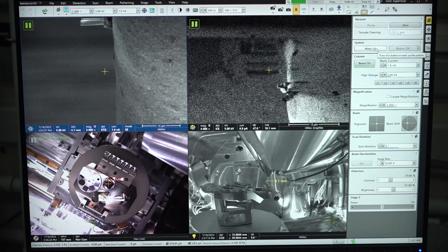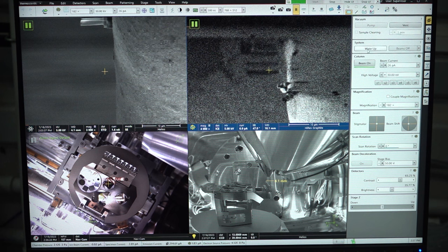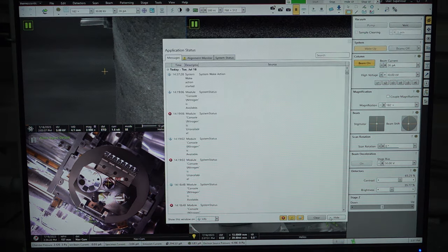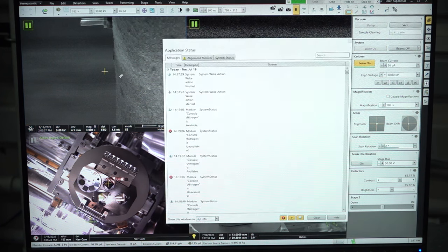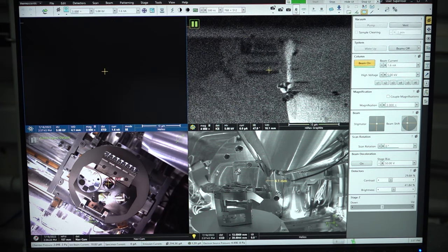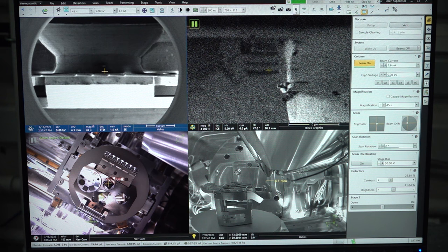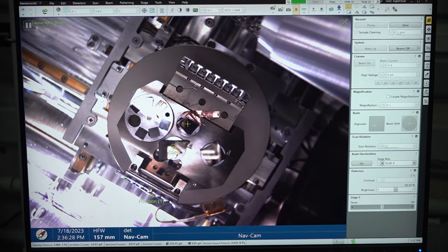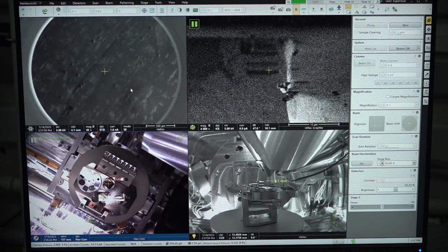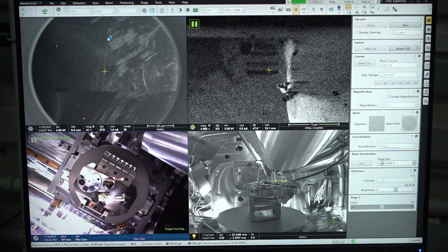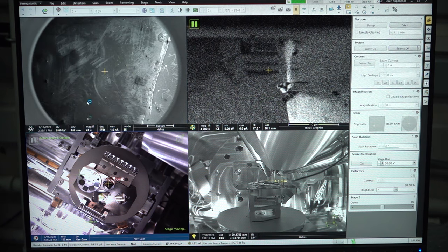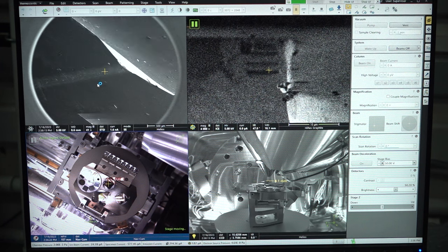In the system option, we have two options: wake up and sleep. If you give wake up, both the emission and beam will start in the SEM as well as the FIB column. Let us give wake up. Now the high tension is on — the beam is on at 5 kV. Let us zoom out the image to locate the sample. I am going to double click on the saved image to go to a specific sample. You can see the cursor is moving to the position. You can navigate inside the camera using this option.